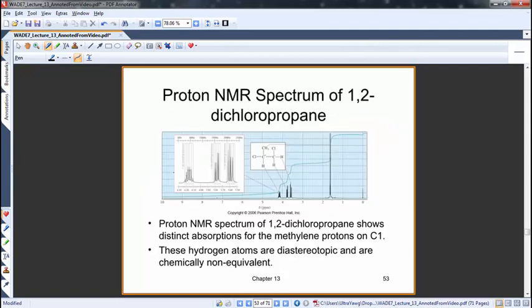Right. So if we want to look at an actual example of this splitting, the methyl group has exactly one neighbor, so it shows up as a doublet, and it does. But these two hydrogens do indeed split each other. So not only do you get this interaction, 1, 2, 3, you get these two guys, you also get this interaction. And so you get splitting upon splitting.